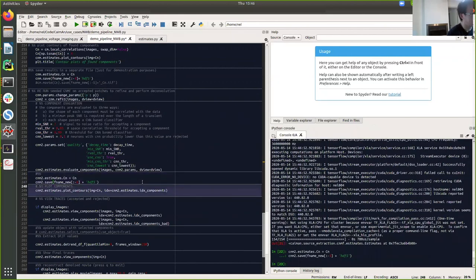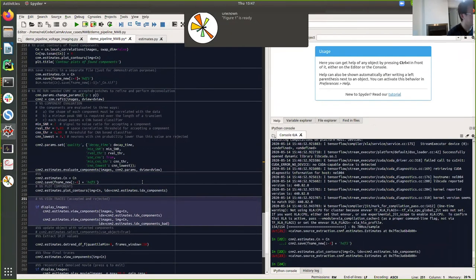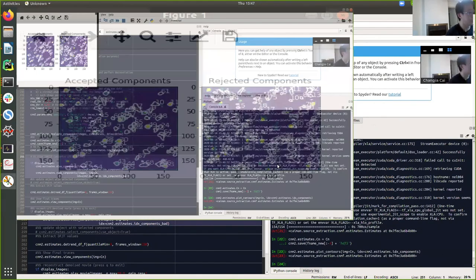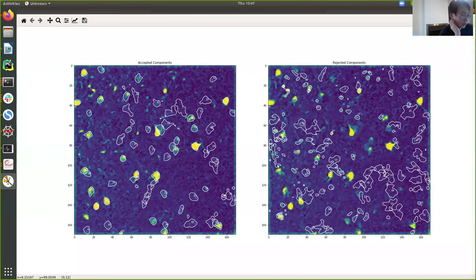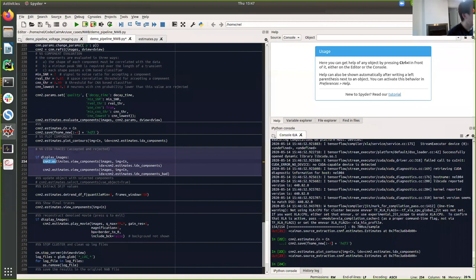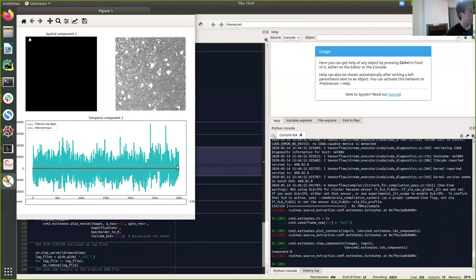So we can see that the result contains the neuron we want to find, but also it contains not relevant spatial footprints. So what we want now is to refine the result we have. So we run it again. And it's done.